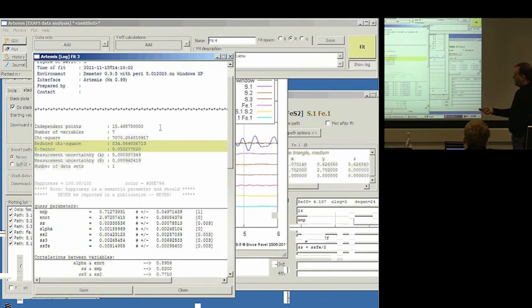E naught hasn't really changed throughout this whole exercise. Alpha is a small number and still consistent with 0. Sigma square, that's a little bit bigger than it was before. That's a little bit smaller than it was before. The one for SS3 is still a little strange. It's still not quite a sensible number, and it's still not even positive definite because the error bar is so large. So this is still a bit small.